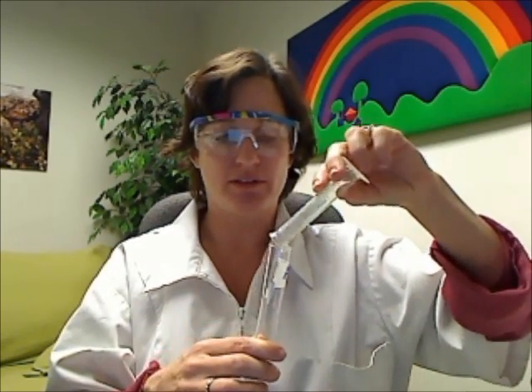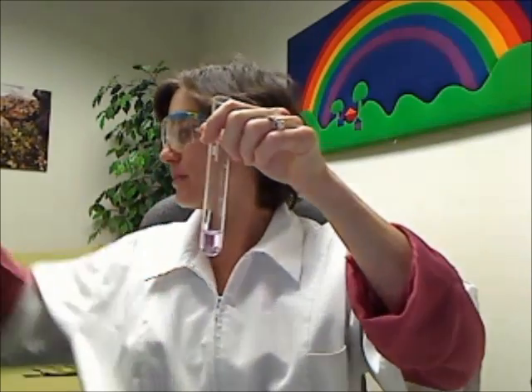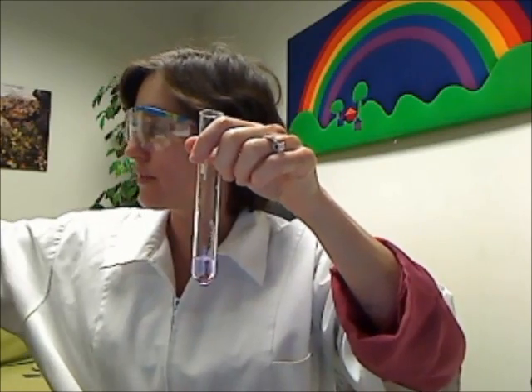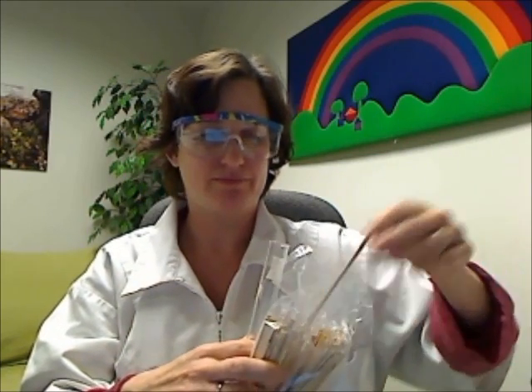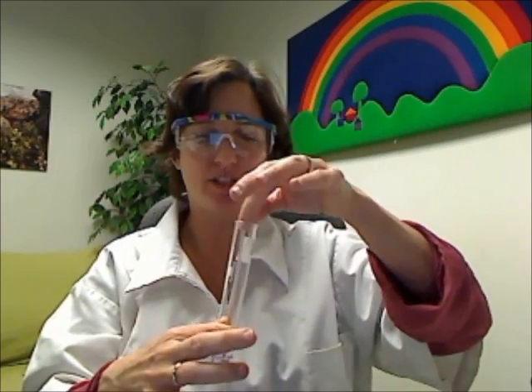Now, how would you do that? Well, where did I put that? Here. All right, so there's some powder in here. It's going to ask you to put 5 milliliters of water in here. So you would just take a small graduated cylinder, put 5 milliliters in it, and pour, and stir it around a little bit. There are some wooden stirring rods here included with the lab if you need them. It's a stirring rod, so you can use that to stir.